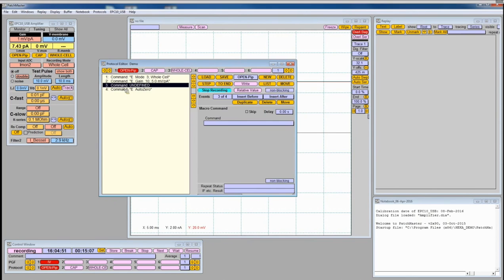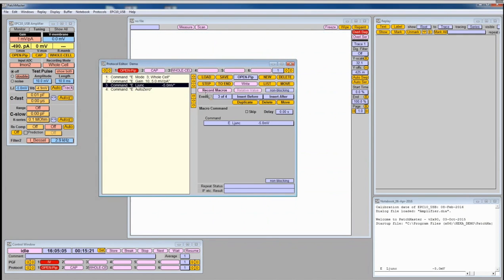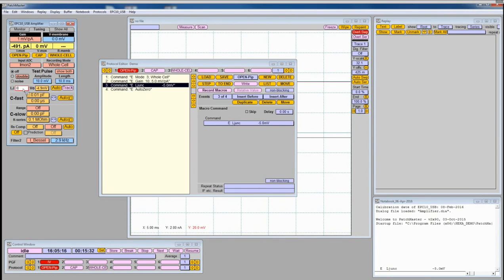Now the next thing is basically only the steps that you want this command to execute. So the first thing would be you select the box, you enter the value that you would like it to have, you press enter, and then you press stop recording, and this is the command that would enter -5 millivolts into this box. I can reset this now again to 0, just to make sure that you will see in a minute that this will all be done automatically.